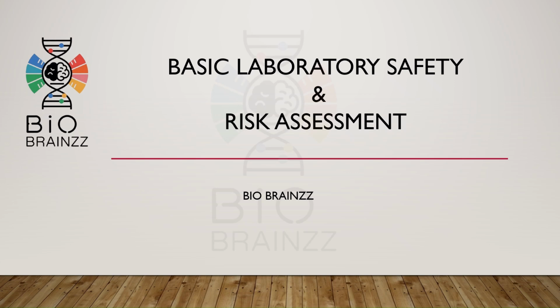Today we are going to discuss a very important topic called Basic Laboratory Safety and Risk Assessment. In every laboratory, safety is the first priority because even a small mistake can lead to serious accidents, contamination, or injury. So, in this session, we will understand how laboratories maintain safety and how risk assessment helps prevent hazards.